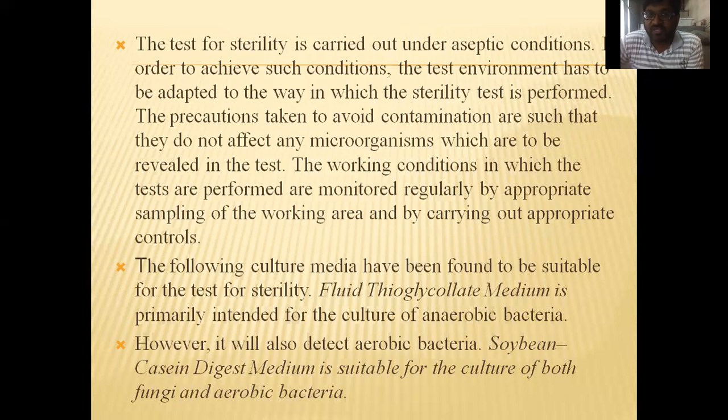The precautions taken to avoid contamination are such that they do not affect any microorganism which is to be revealed in the test. The working conditions in which the tests are performed are monitored regularly by appropriate sampling of the working area and by carrying out appropriate controls. The following culture media have been found to be suitable for this sterility test.